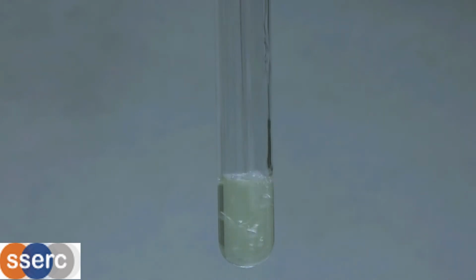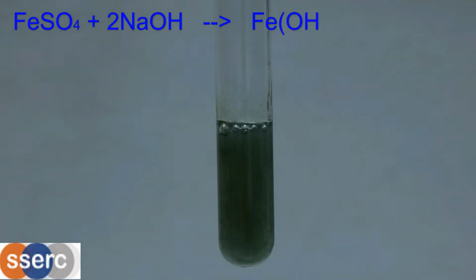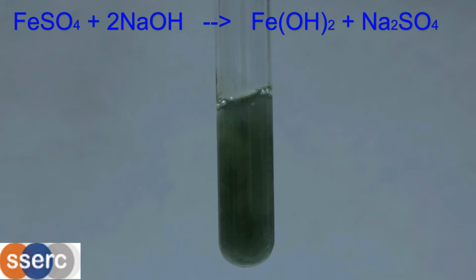Next we'll look at iron. Iron has two common forms, iron 2 and iron 3. We'll start off with iron 2. Solutions of iron 2 compounds are usually pale green, like the iron 2 sulfate here. On addition of a few drops of sodium hydroxide, you get a dark green precipitate of iron 2 hydroxide. On adding excess, as with the copper, you simply get more precipitate.